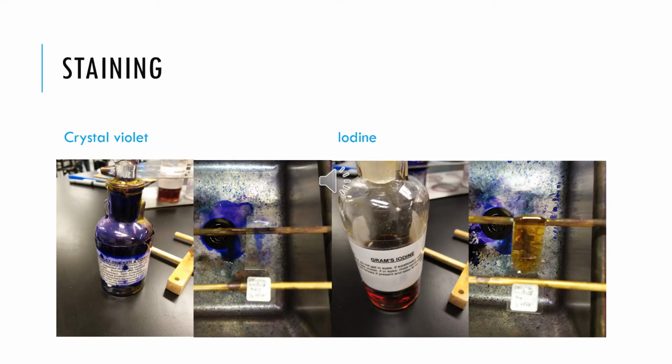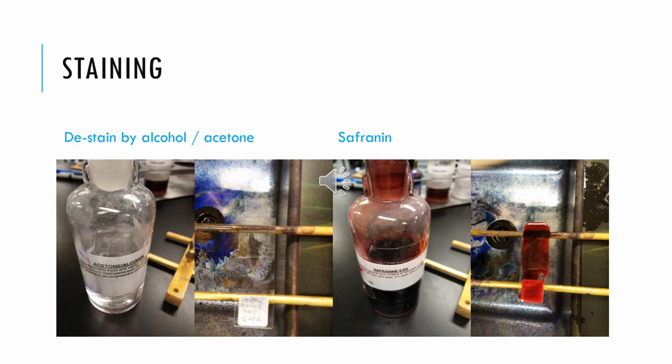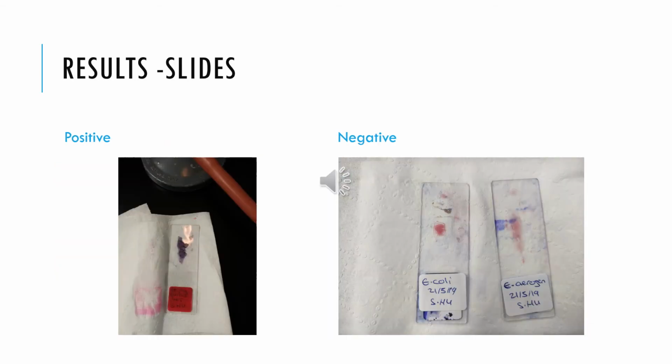In staining the bacteria, crystal violet colors the bacteria, while iodine prevents the removal of the dye. Gram-positive bacteria have a thick cell wall that can retain the color. Gram-negative bacteria have a thin peptidoglycan layer that will not hold the violet dye when decolorized by the alcohol. Safranin is used as a counterstain that will directly stain the bacteria that has been decolorized. After drying the slide, the smear will appear purple for positive and pink/red for the negative.